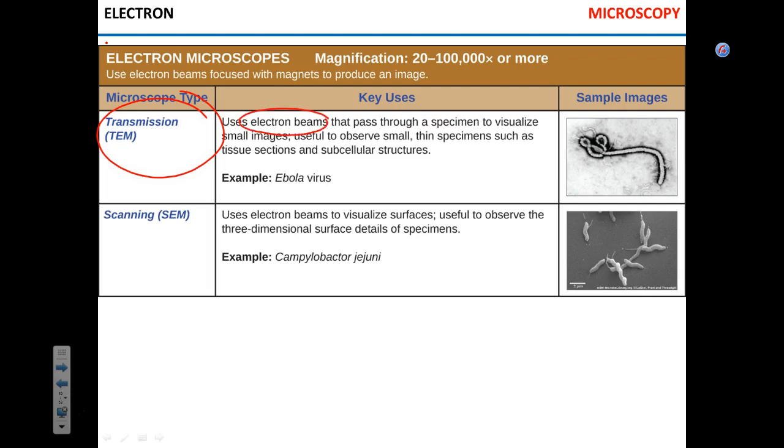So these electrons run through the specimen and they get refracted, they get reflected, and the electrons that pass through get detected by whatever device. Usually it's based on the photoelectron effect. They get detected and software analyzes the pattern of electron refraction. Does that make sense? So basically it's sort of a special electronic eye that allows us to analyze how trajectories of electrons were changed.